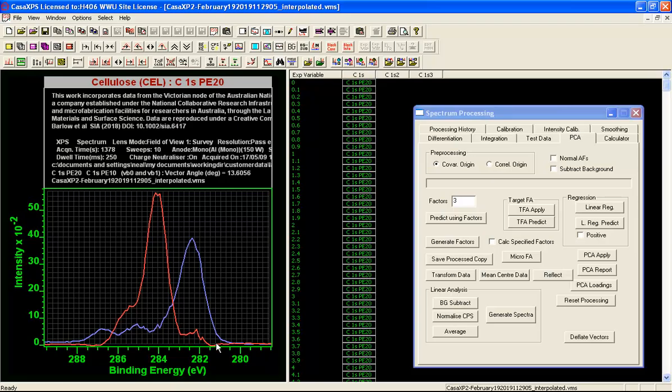So that's not a significant problem for identifying this as cellulose. And then we have another form that represents a combination of a CH type peak. There's obviously some other oxygen bonded peaks here, and maybe another one. So maybe there are 4 peaks beneath here.